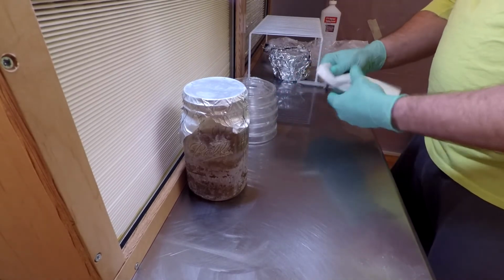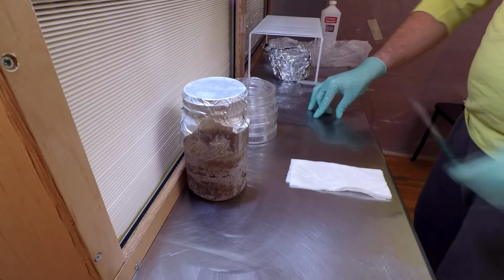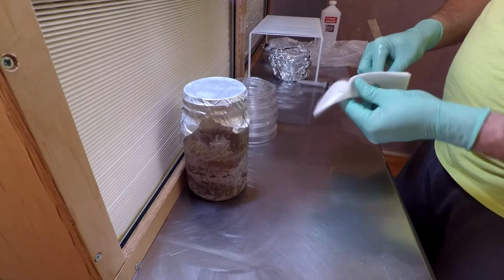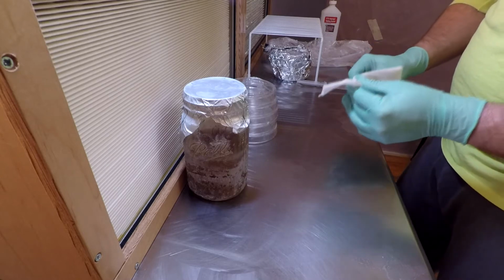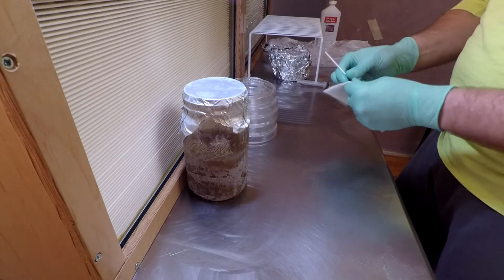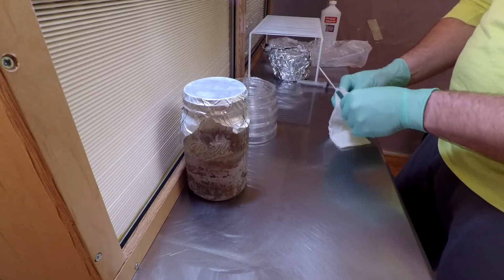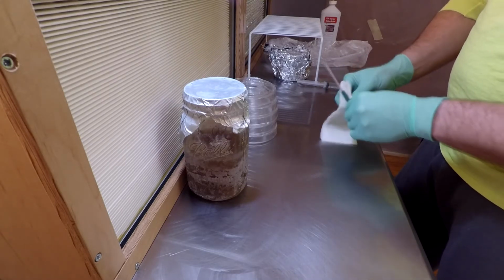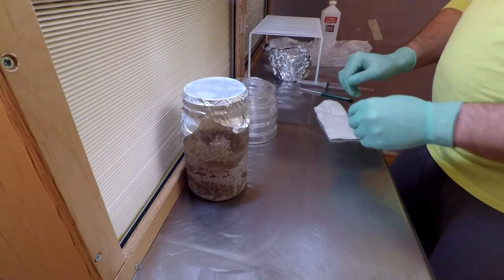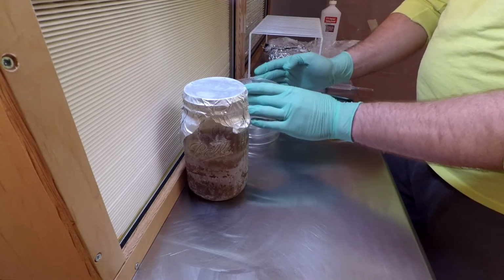But again, ideally, you really should be using the route with the inoculation loop for some guaranteed results. The only reason I did it with the syringes at first is because I thought I would be able to get away with it. I guess not. I've done it that way before with other oyster mushrooms. I'm pretty sure I've done that with king oyster mushroom spores too. So I know that way can work, but if it's too wet, there's really nothing you can do about the high bacteria count, or any bacterial count if it's too wet.